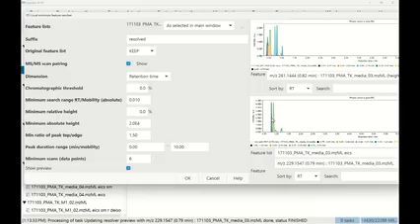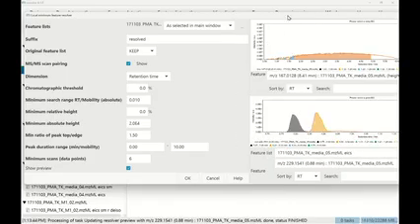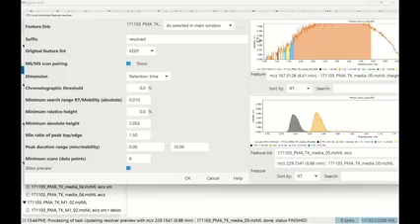just select one feature list here, for example, it would automatically show me one nice chromatogram, and maybe on the top it's actually trying to get a chromatogram that's a bit harder to resolve, or that might be just noise. And then we can try to optimize the parameters so that from a noisy chromatogram like this, a baseline, we don't pick so many peaks. It's always kind of a balance that we have to really set up.